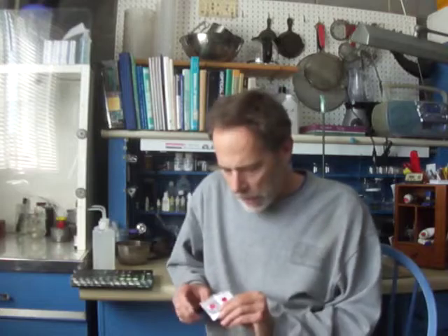So anyways, I do have another sample to look at that he gave me, and it's a mineral sample, and I have a feeling this is going to be a lot more difficult. But I'll probably do a borax bead and a flame test from the get-go too, to see if that gives us any information or not.